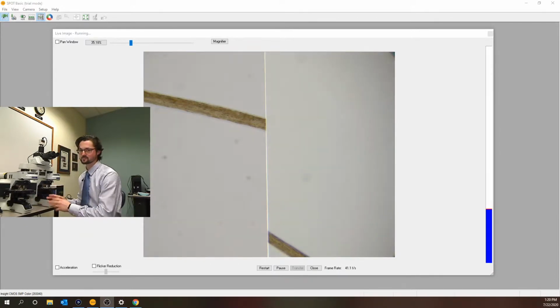Once you've got Kohler, then your color balance should work, and there are three ways that I know of that you can try to play with that balance between resolution and contrast. And beyond doing Kohler, everything else in the microscope will be working as color balanced and intensity balanced.